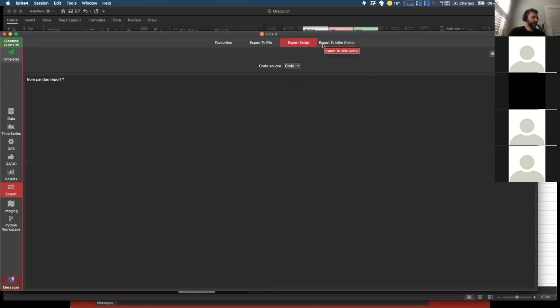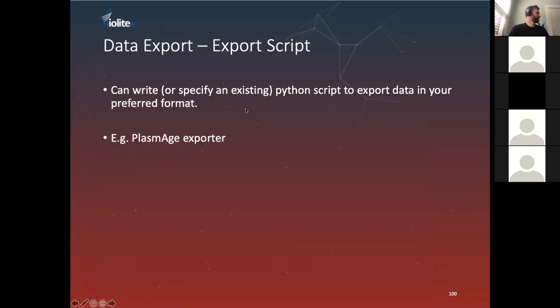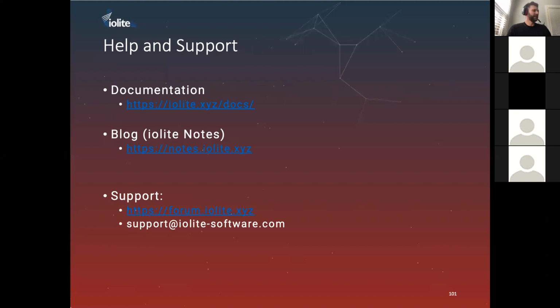And as I mentioned, iolite Online is still coming soon. So I think that covers pretty much everything from importing your data, calculating results, viewing and visualizing your data, running quality assurance on it, and then exporting your data. So that's pretty much what we've got for this webinar.